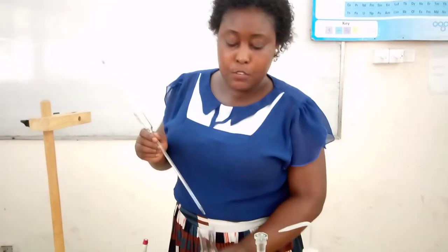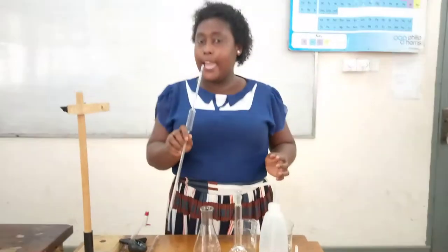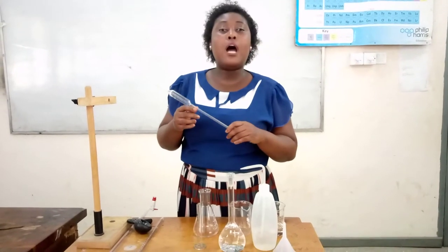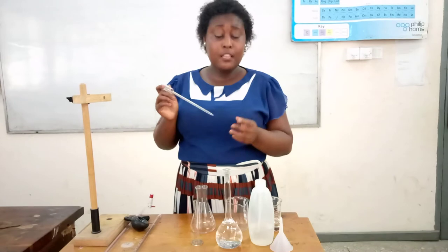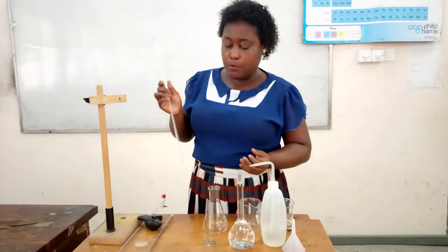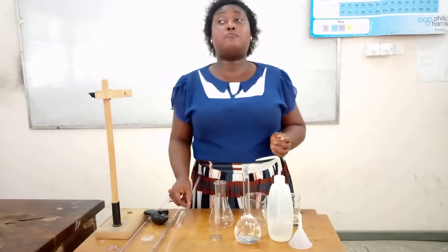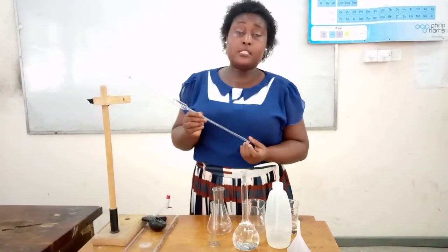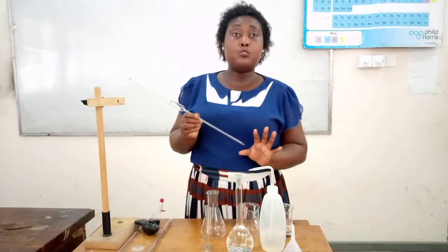It's funny when students are doing it and they don't rotate it — you will see droplets of solution hanging. You see students doing this, trying to shake it for the water to come out. Some also blow air inside the pipette. Please, this pipette is not a blowout pipette. There is a pipette called a blowout pipette where you can blow air, but this one you don't blow air. Just rotate it at 360 degrees and it will remove the solution that normally hangs. When you are done, ideally you should also clean the tip of the pipette.